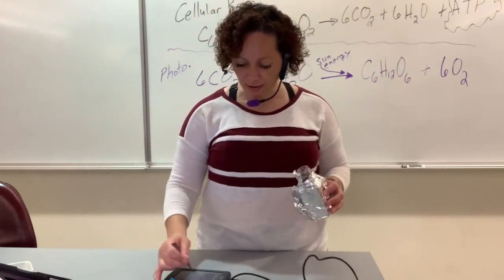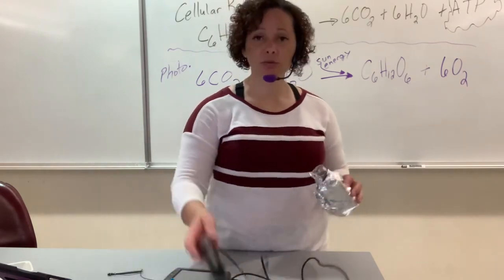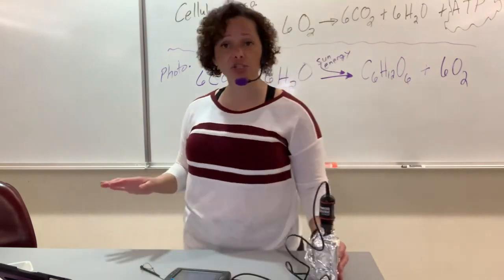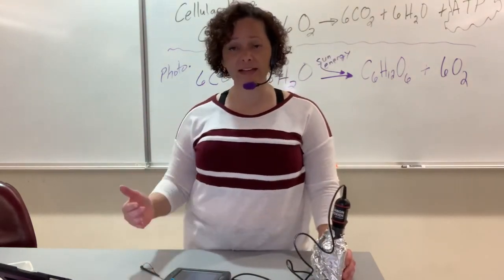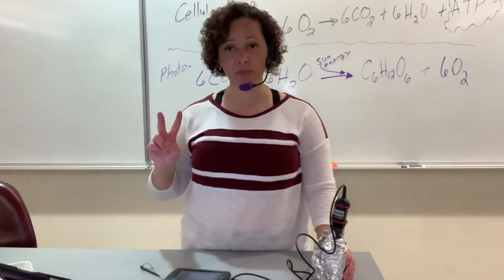You just hit File, New. Remember how I showed you in the beginning how to dump your files? Go ahead and discard it. Do it again. Boom. Run it for 3 minutes. Same exact thing that I just showed you. And then go through the process of analyzing your data and getting the slope, which is M, and you're going to write it for slope number 2.